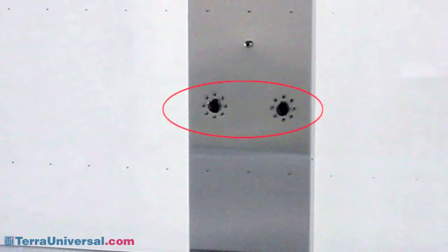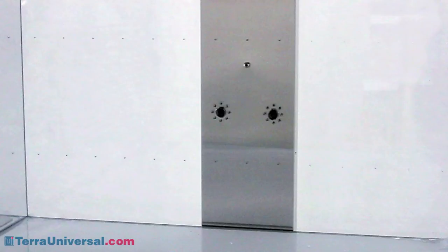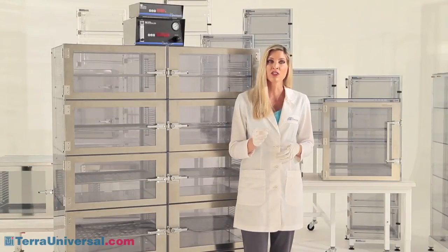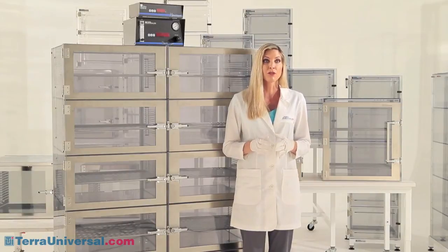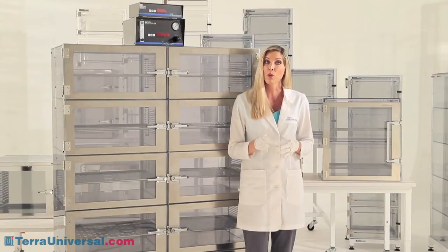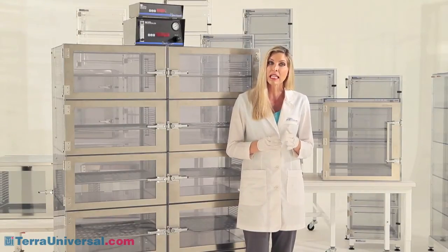Optional ionizing modules enhance ESD safety by issuing a balanced stream of ions that neutralize static charges throughout the cabinet. Multi-chamber desiccators feature a plenum wall that adds strength to the cabinet and ensures that nitrogen, introduced at the top of the plenum, enters all chambers uniformly. Ports are provided for introducing nitrogen, monitoring internal pressure, connecting the optional nitro watch humidity sensor, and installing Terra's relief bleed valves. Normally you add one of these valves to each chamber, ensuring that displaced air quickly exits the cabinet.